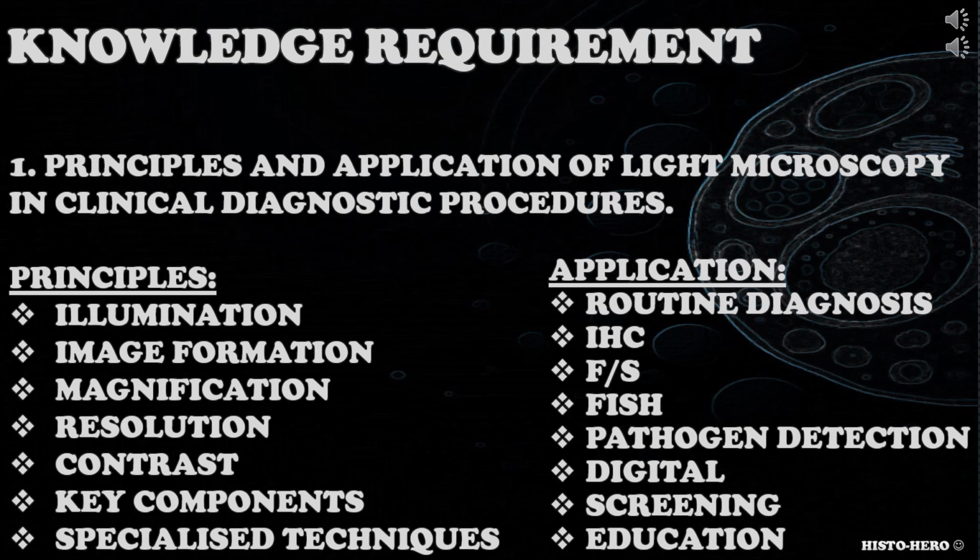Let's have a look at the first knowledge requirement, which is for you to know the principles and application of light microscopy in clinical diagnostic procedures. What is light microscopy? How does light microscopy work? What is the application of light microscopy in clinical setting?